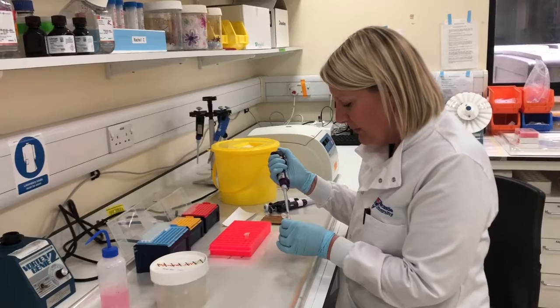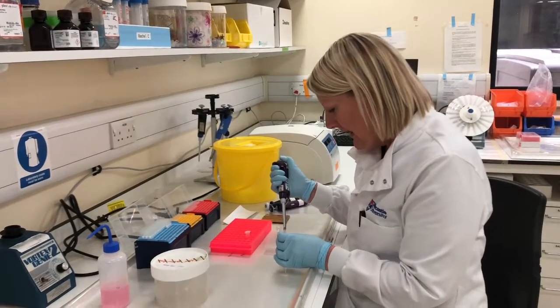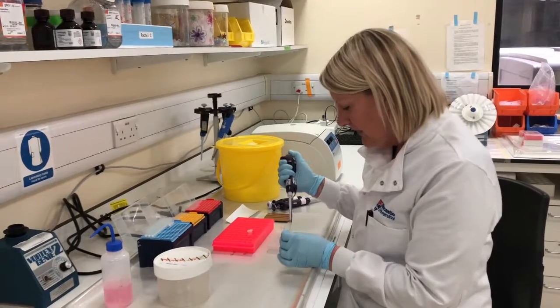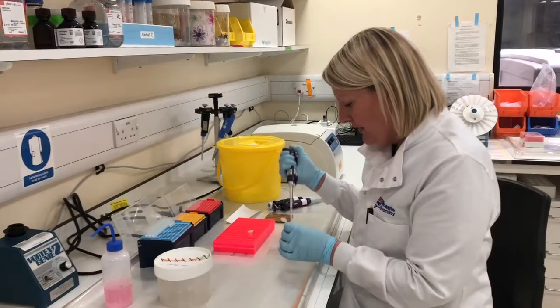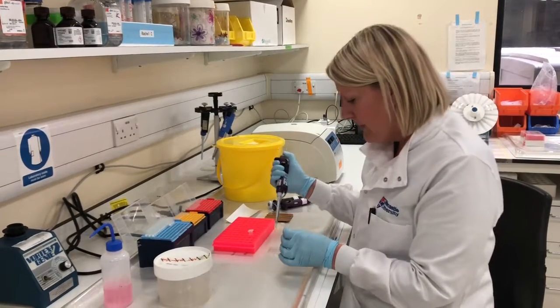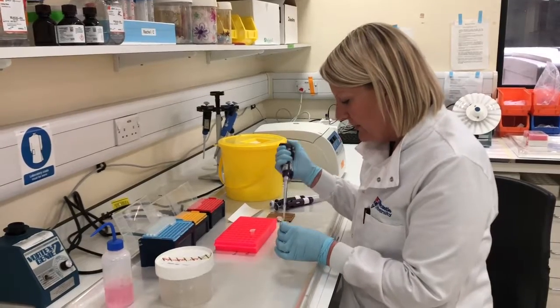So all of our cells in our body have DNA in them, apart from our red cells, and when we extract the DNA from those cells, we can measure how much is there, and then once we know how much is there, we work out how much we need to put into the reaction plate for the PCR reaction.